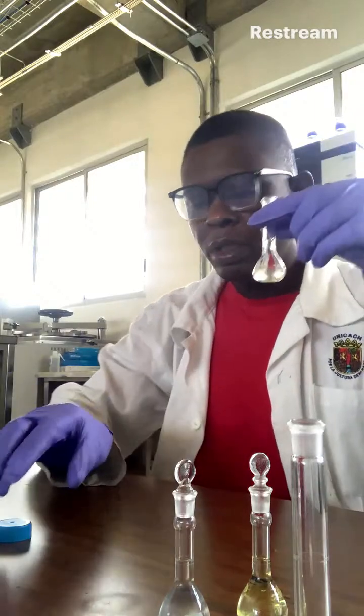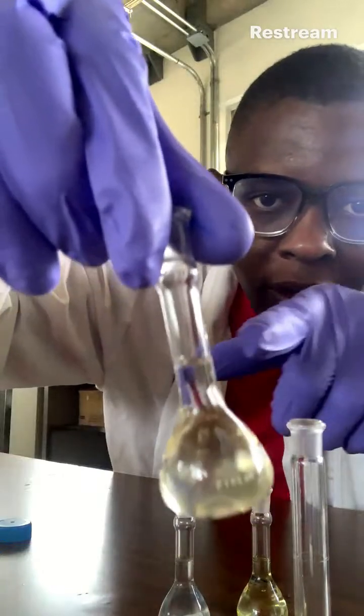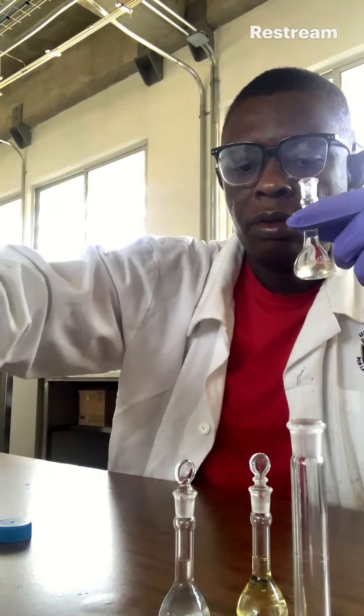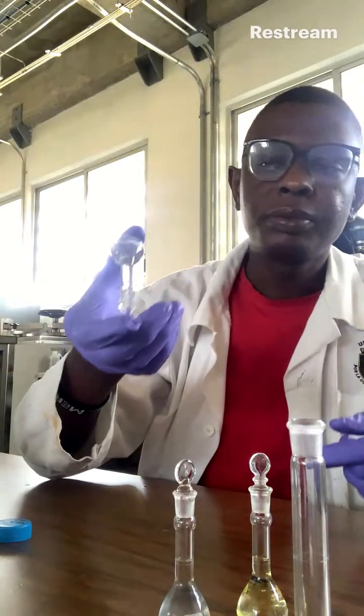Okay, so I have diluted it. Remember, there's a meniscus line, so we work with the meniscus line. I will close it and shake it for a proper mixture.